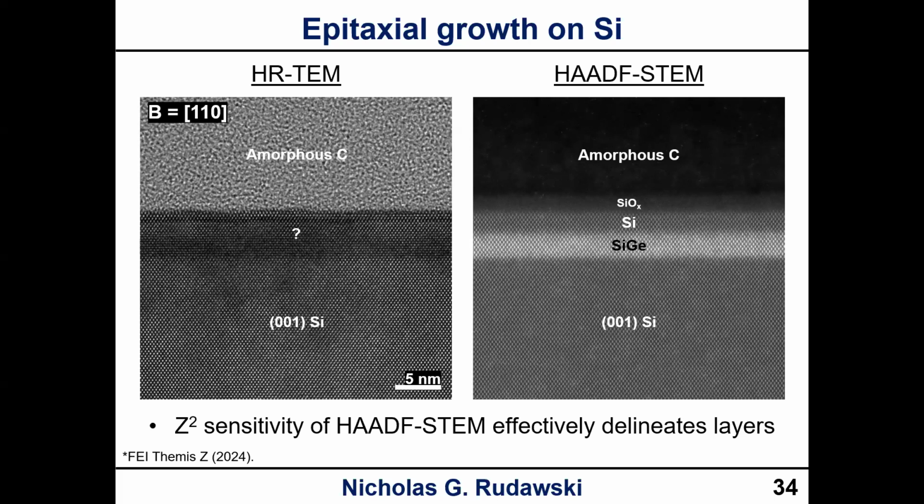Yes, you can absolutely do two-beam imaging in STEM mode. That is very possible, especially if you reduce the alpha value down significantly to single-digit millirad. You can do that to very good effect, just like you would in TEM mode, and you will have the big advantage of the effect of chromatic aberration inside the sample being much less of an issue. So the short answer is yes, that can absolutely be an effective way to image the samples.